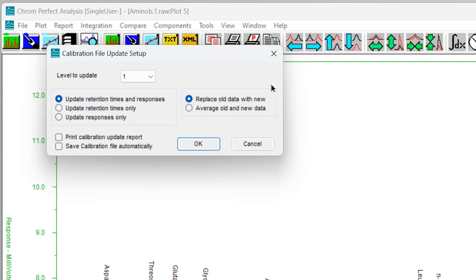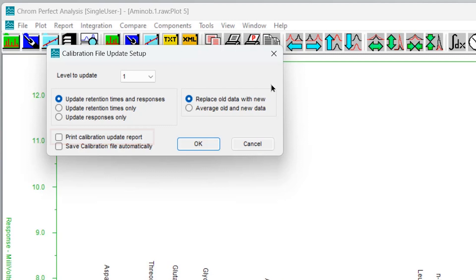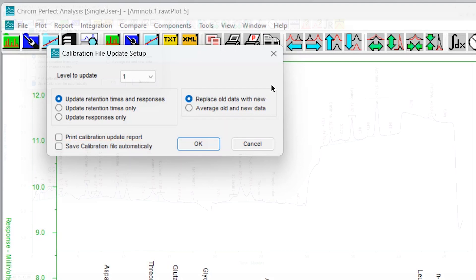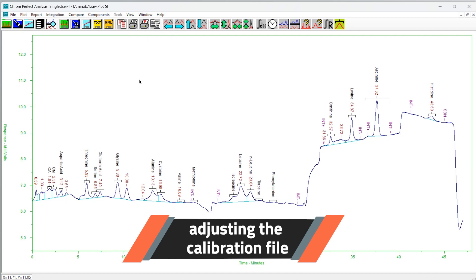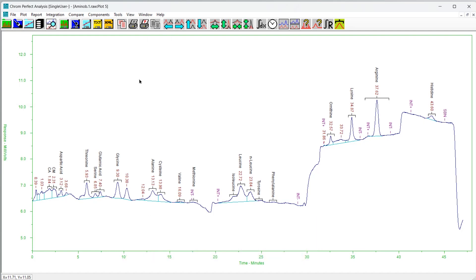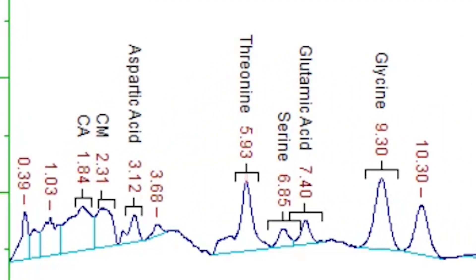This form closely resembles the one in the calibration file editor; consult that chapter for an explanation of the controls. There is no need for a bound file name since the integration data is already in memory. When performing updates to several levels, it is preferable to wait for all levels to be updated before printing the update report. There is an extra checkbox which controls whether the calibration file is saved.